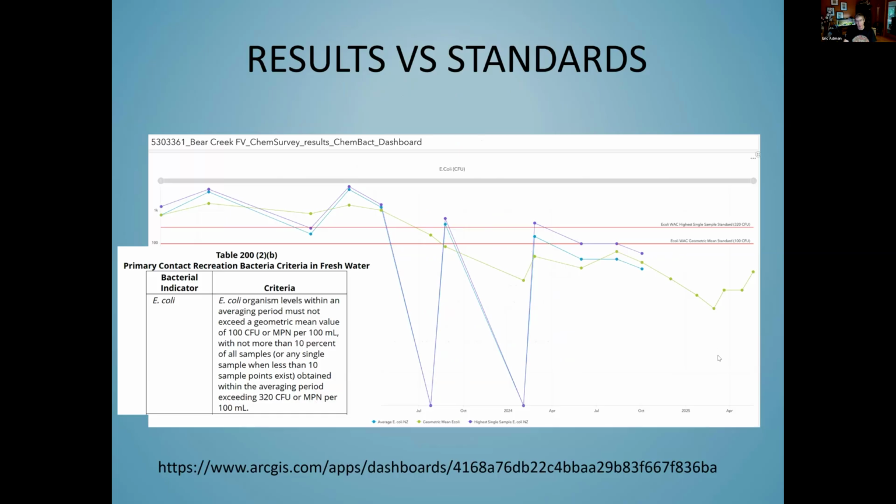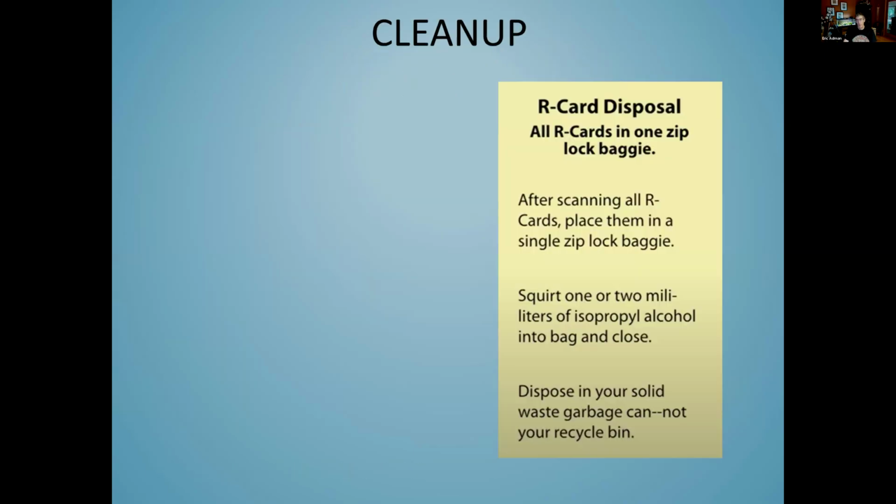So this is again kind of comparing the dashboard to the standard. So you've gone through that process. Now you're going to clean up your cards. Once you're done with the R cards, you can essentially dispose of them in regular garbage.